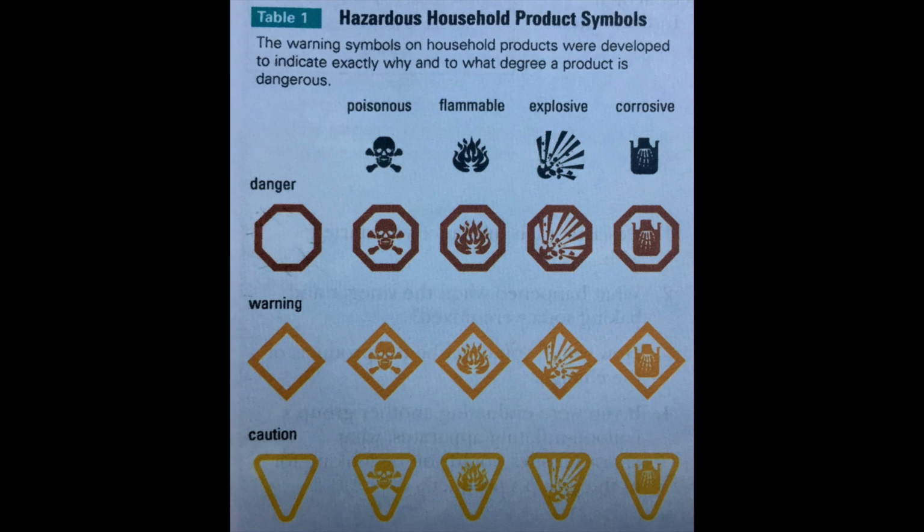Do the experiment and do it carefully, not only for yourself, but for those around you. And understand what the safety requirements are for every experiment done, every one, and be cautious when doing any experiment.